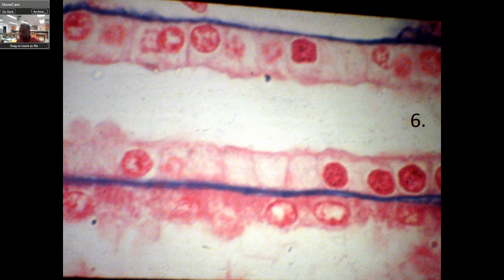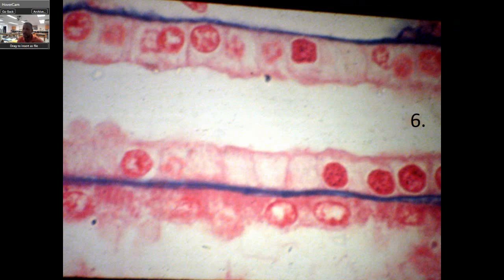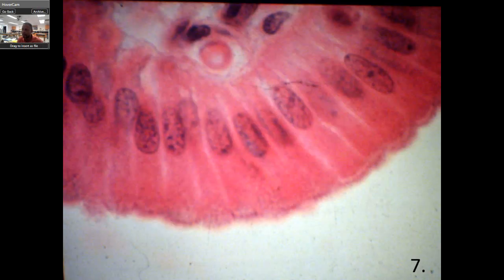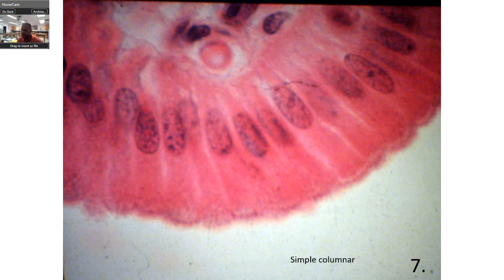Here's a look at these cells. This is simple cuboidal. Look at this shape — if this was columnar, imagine this being a little bit longer. And the answer to the next one is simple columnar.